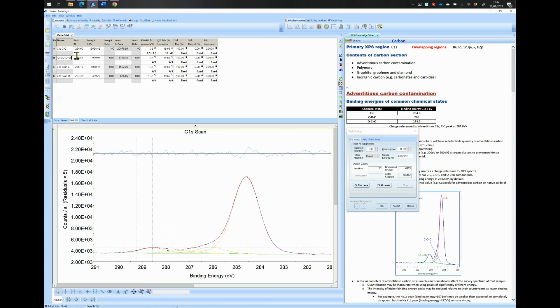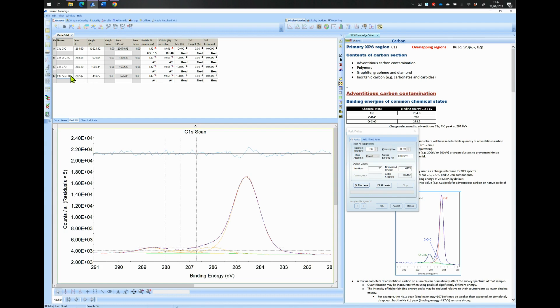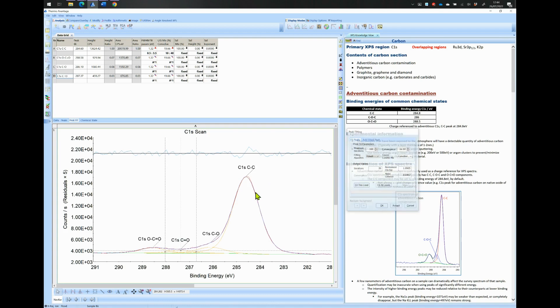The peak close to 286 eV is labeled as the C single bond O peak. Write C-O bond next to the C1S of peak C. The peak close to 287.9 eV is labeled as the C double bond O peak. Write C equal O bond next to the C1S of peak D. That is it, you have now fitted carbon 1S.